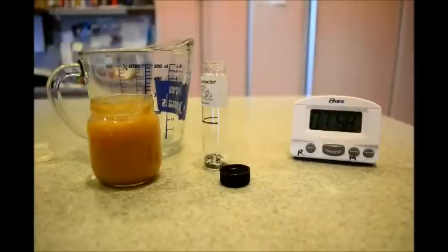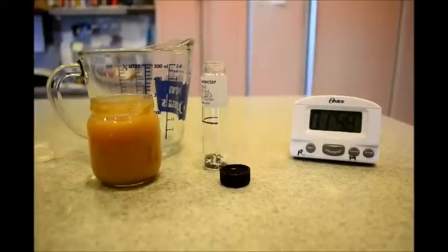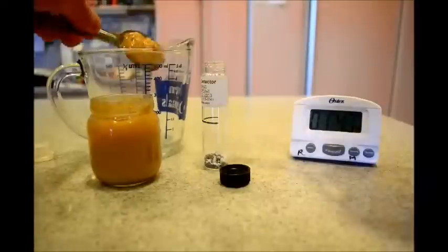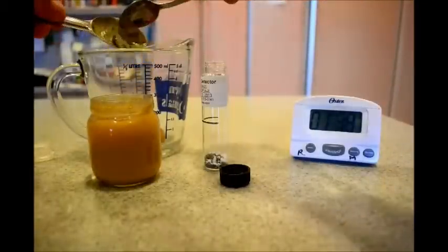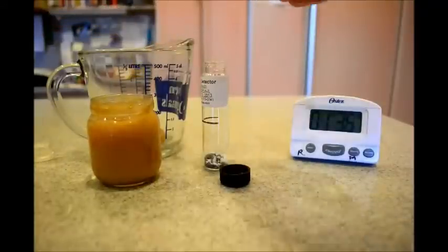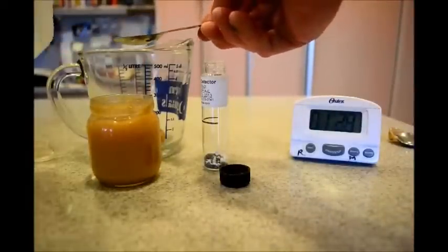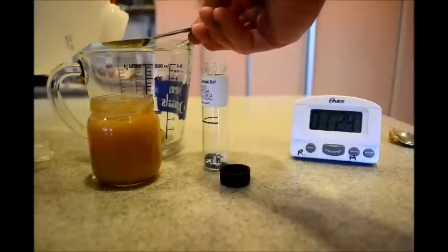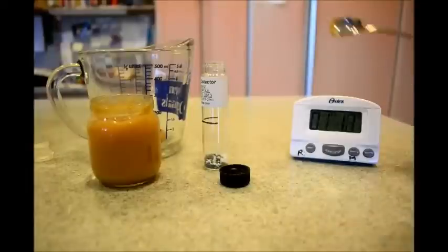Wait for two minutes. In the meantime, we're going to prepare the sample baby food. I have a tablespoon — doesn't have to be exact. Now add an equal amount of very clean water; distilled water is best. Let's mix that very well.